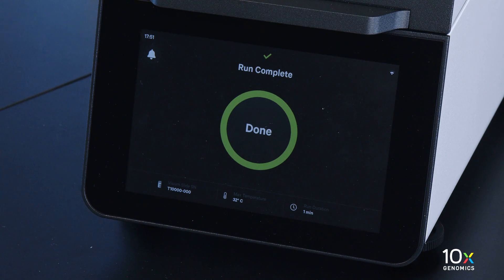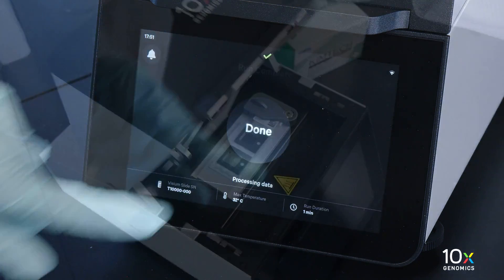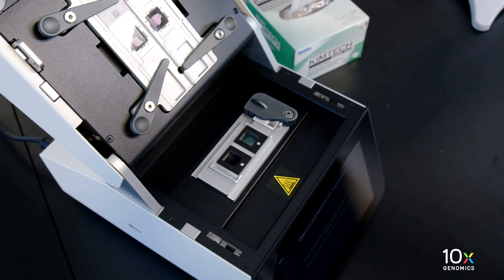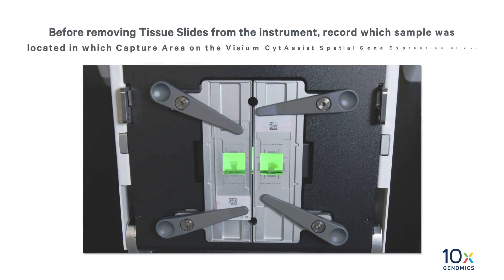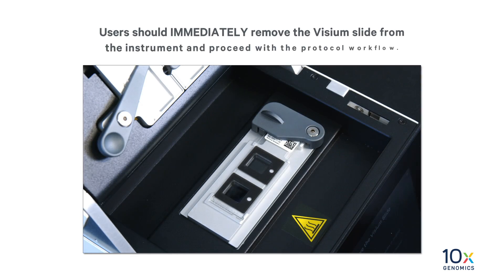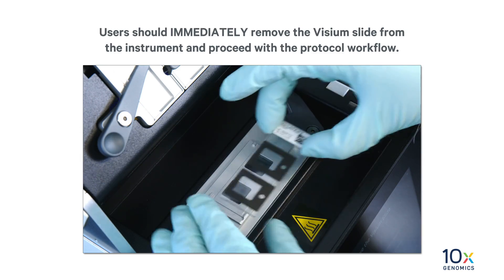Green indicates a successfully completed run. Click the done button and open the lid. Do not power off the instrument at this time as it needs to process support data. Before removing tissue slides from the instrument, record which sample was located in which capture area on the Visium CytAssist spatial gene expression slide. Users should immediately remove the Visium slide from the instrument and proceed with the protocol workflow.